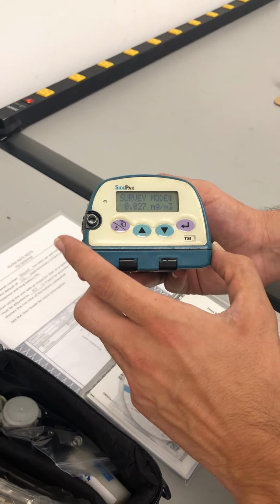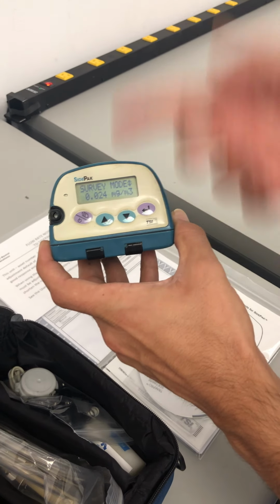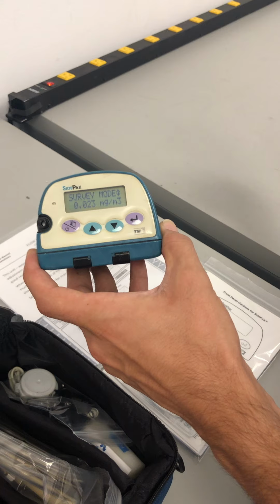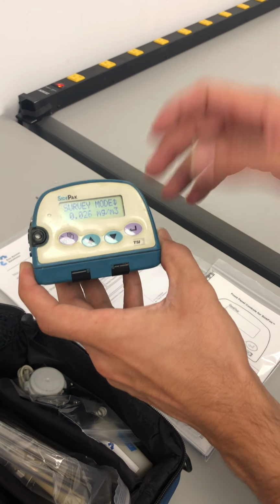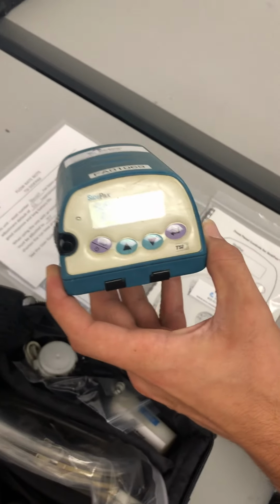So this is anytime, you know, if you want to say, okay, what time is it now? 12:05. All right, we have 0.022 or whatever milligram per cubic meter for that instantaneous moment.